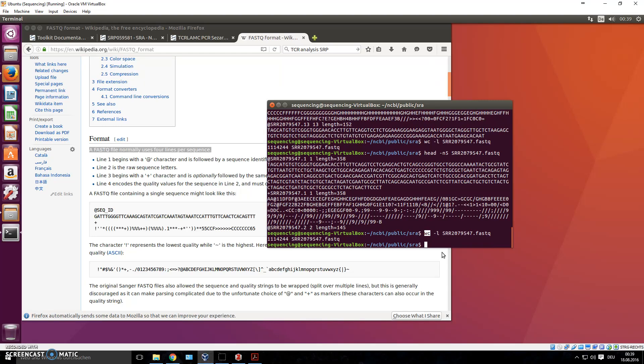We'll keep learning how to use these commands on big files and many files at the same time, slowly automating all of these processes. Right now we're just learning how to look into files, but the goal is actual analysis. Check out the other videos and the website nextgenerationsequencinghq.com, where you'll find a course on how to combine all these skills into a bioinformatics pipeline that could turn a month's worth of work into 10 seconds.